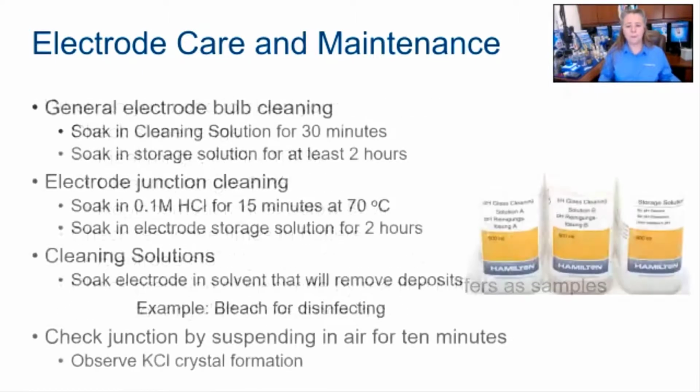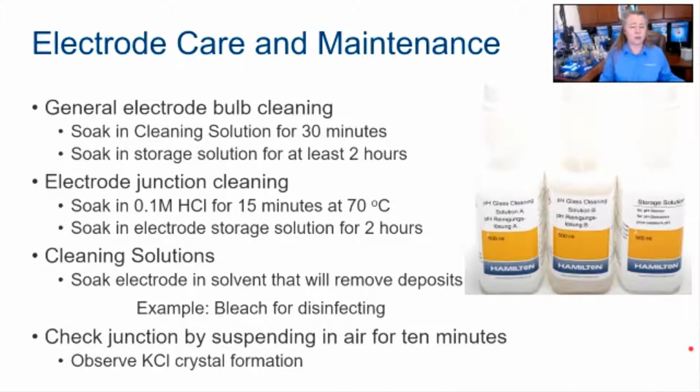How do you clean a probe? Well, you clean a probe by using cleaning solutions. Every manufacturer has their own. I recommend you use the one that the manufacturer of your probe suggests. If they don't have one, Hamilton has a really good line. There are some generic ones out there and you can make your own buffers. It just depends on your time and constraints.